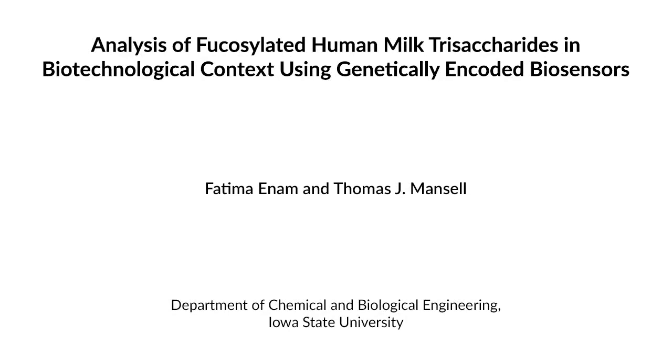This method can help answer several key questions involved in the production of human milk oligosaccharides. First, how much of the product do I have? And second, what is the specific carbohydrate linkage? The goal here is to simplify and speed up the process of quantifying and characterizing these human milk oligosaccharides.